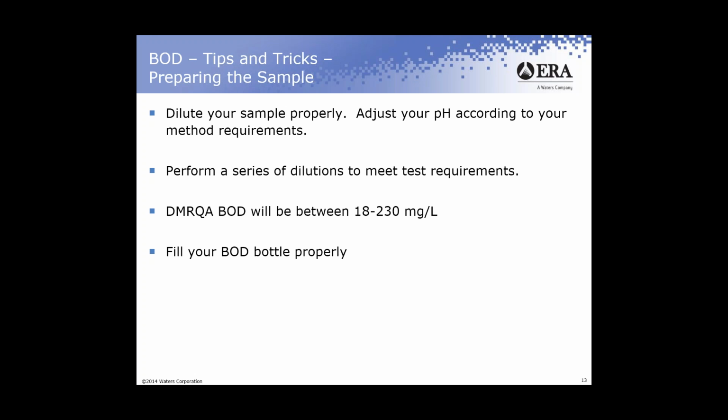Because if you don't have that barrier, once you put it into the incubation, if that dries out, you're leaving a place for extra oxygen to get into the sample through the air. The more oxygen you introduce into that air, the less oxygen uptake you're going to read in your sample and the lower the values are going to be. So that's a real important thing to make sure. Make sure too that you protect that flange using either plastic cups, I know that they make good ones, or some foil to put over the top to make sure that you've always got that water vapor barrier in there.